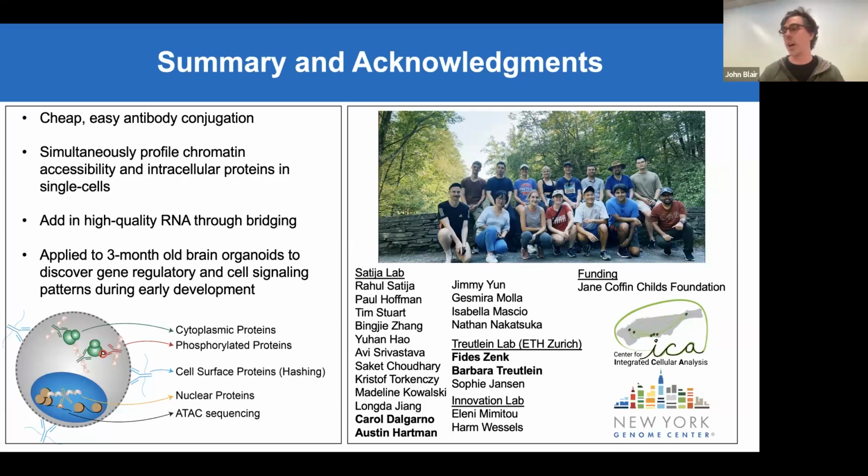For the gene protein-chromatin analysis, how did you assign the pseudotime axis to the data? Right. With the pseudotime, we used Monocle for assigning that. And for the early, mid, and late bins, I assigned those where there were small clusters of forebrain precursors that were transitioning towards the neurons. So the early bin is forebrain precursors that are likely self-renewing, staying in their forebrain precursor state.